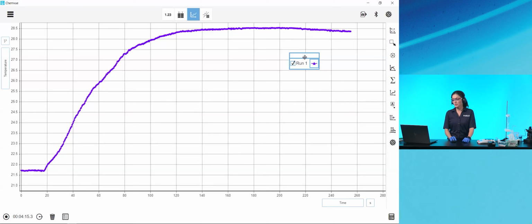If you're a SparkView user or a Capstone user, you'll recognize many of these icons. Just like other software, if you know one product in the family, you kind of know them all. So your learning curve is going to be shallow here. But if you're a brand new user, you'll see that the tools here are pretty straightforward. They're surfaced right at the top level. You can see them all. And the tools that are most commonly used are right there in front of you.